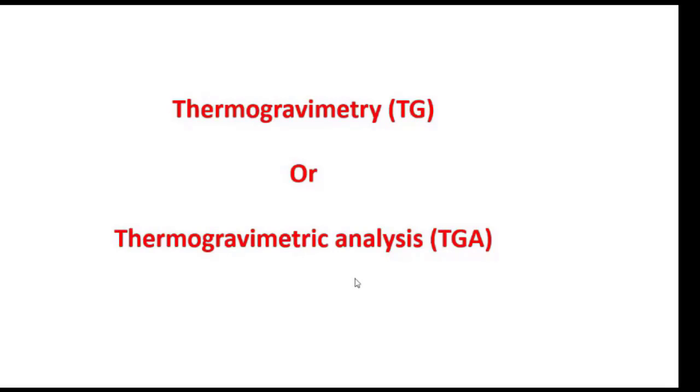So thermogravimetry: thermo means with heat, by process of heat. Gravi represents the measurement of weight, and metry is the analysis. So analysis by weight measurement with the process of heating is what is called thermogravimetry or thermogravimetric analysis.